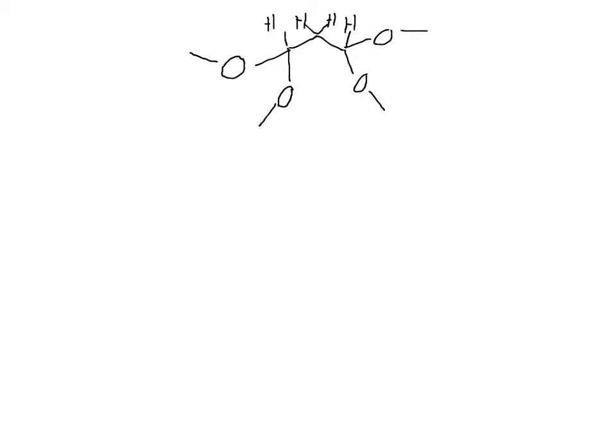The key here was really having to think about the chemical shifts, right? And understanding where the chemical shifts are at. If you're getting deshielded by 2 oxygens, you're going to be much more deshielded than you'd expect, around 4.5. That was the key trick here, was realizing this 1 hydrogen was at 4.49. It must have been attached to something, it must be really close to 2 oxygens. And then also seeing the splitting, seeing those are triplets and they're coupled to each other.